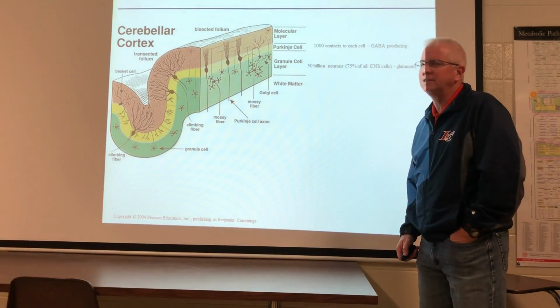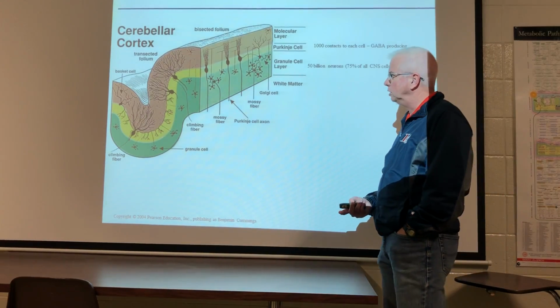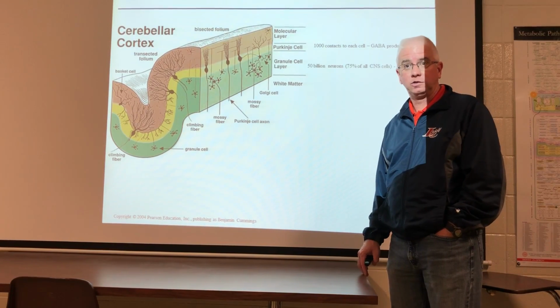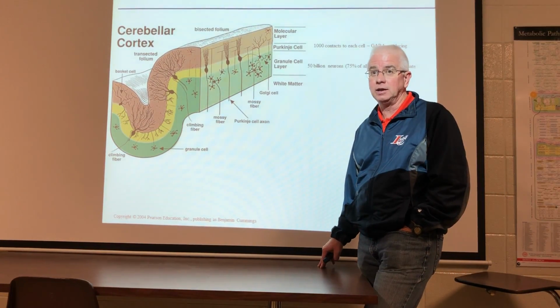So in a histology section of the cerebellum, whenever you do this for Dr. Du Bois, you will learn that the cerebellum is organized into 3 layers that are very distinct from one another and very easy to locate histologically.